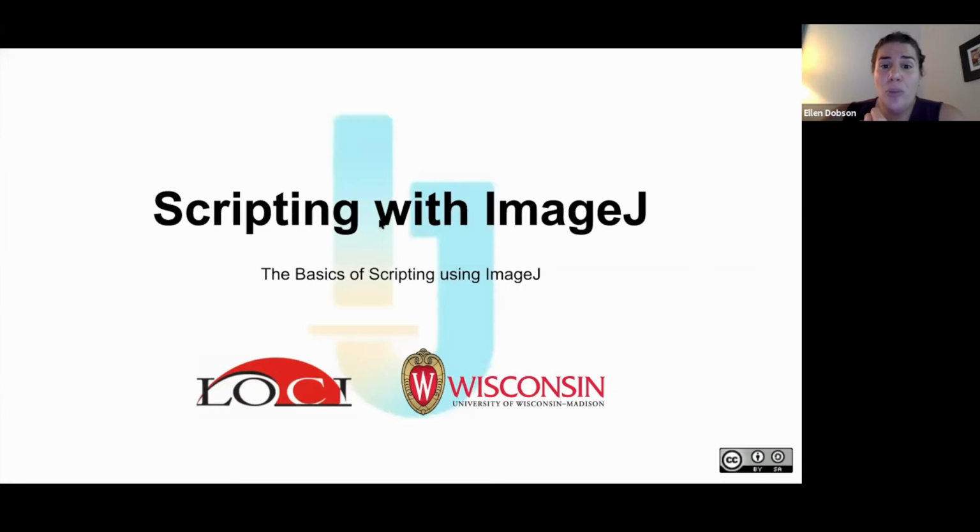Can you measure the volume of an object from a stack? Yes. Presumably if you have a calibrated image, you should be able to quantify the volume based on the number of slices and the areas. Is it possible to identify an area of interest in an image? For example, when you're looking at tissue, you may only want to evaluate a portion of it.